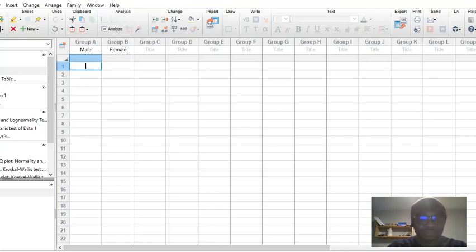So I'm going to just input values like 10, 46, 46, 67, 56, 78, 45, 34, 87, 67, 55, 45, 66, 89.